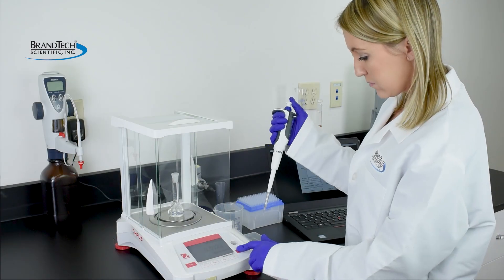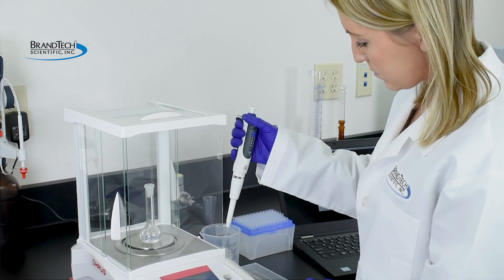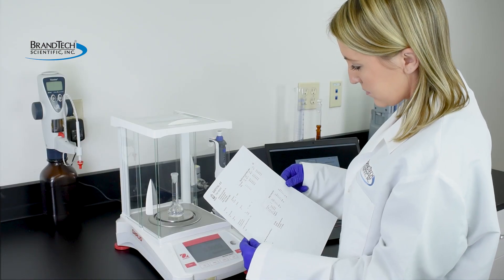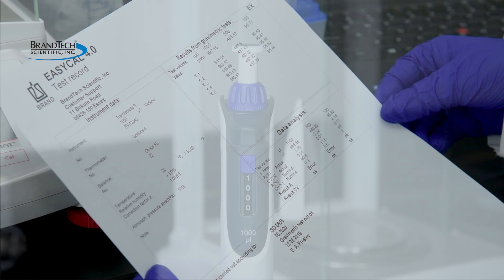First, gravimetrically determine the actual dispensed volume of the pipette. Our SOPs provide more detailed information. When the gravimetrically determined mean volume deviates from the volume setting beyond the permissible tolerances, it is necessary to adjust the pipette with the easy calibration feature.